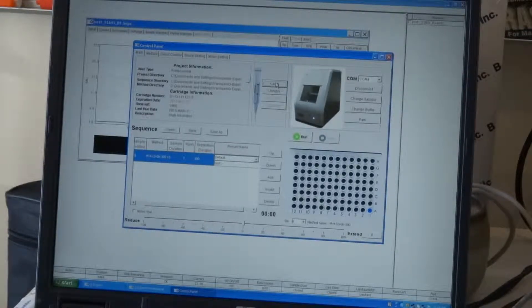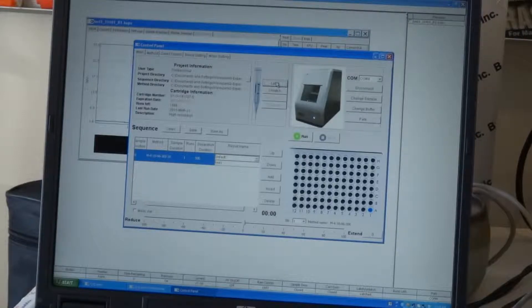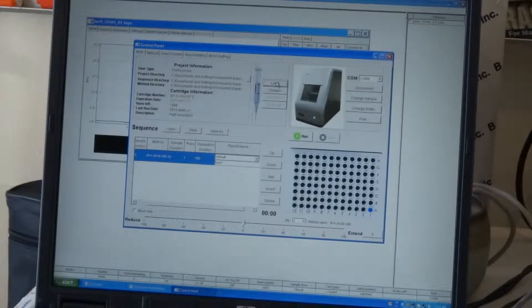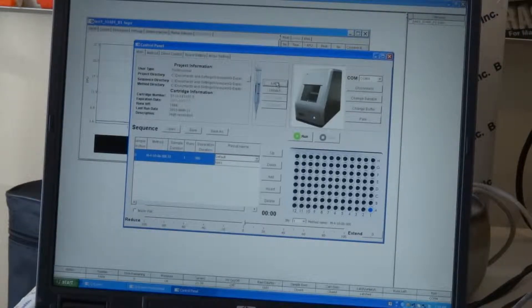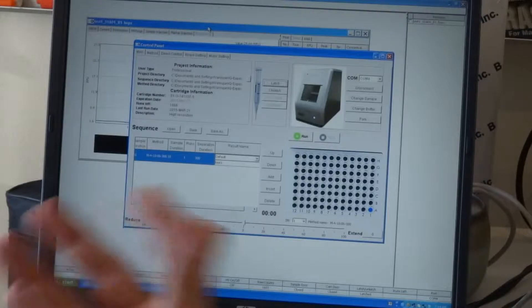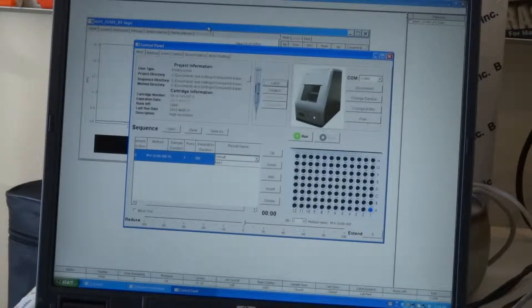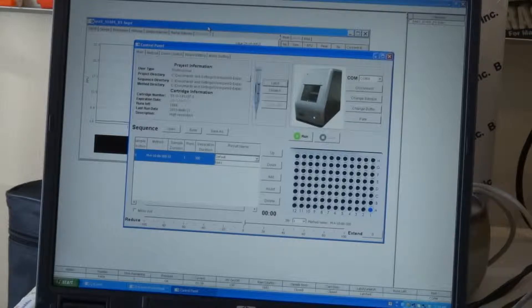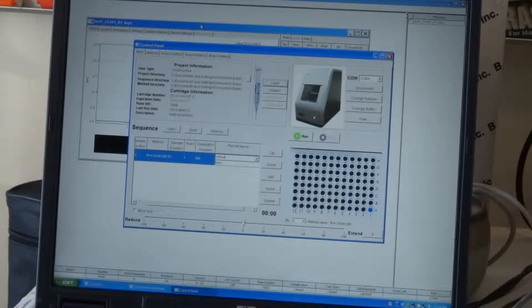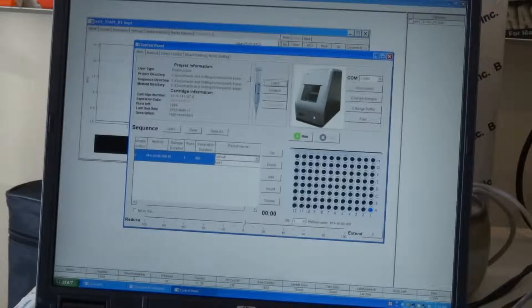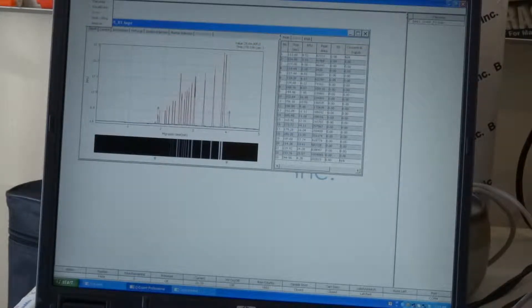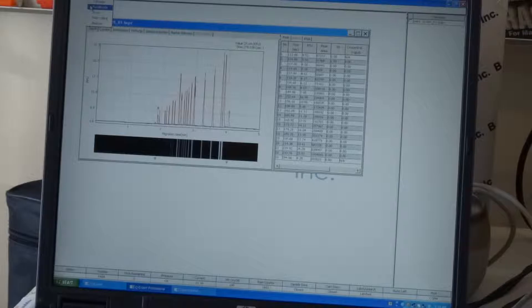At this stage, as soon as the cartridge is inserted in the instrument, the instrument prompts to calibrate the cartridge. But if it does not, and the cartridge has already been calibrated, this is where you go under the tools to recalibrate.